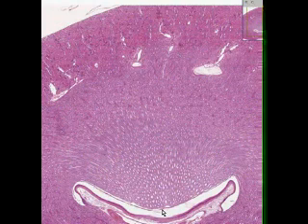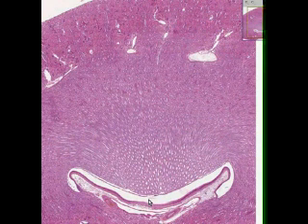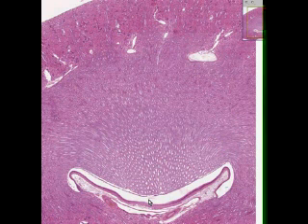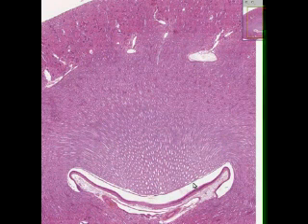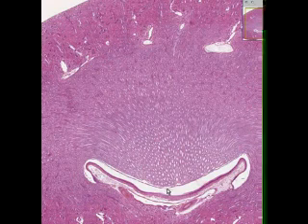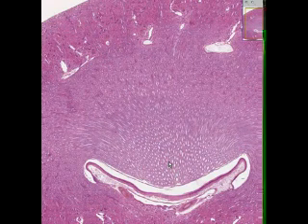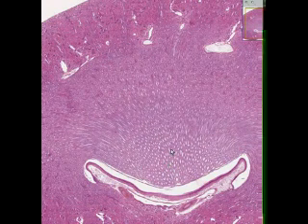The renal papilla dips into a urinary space lined with transitional epithelium called a minor calyx. One or more minor calyxes fuse to form a major calyx, which we don't see here. Three or four major calyxes then fuse to form the renal pelvis, and the renal pelvis rapidly tapers off into the ureter.